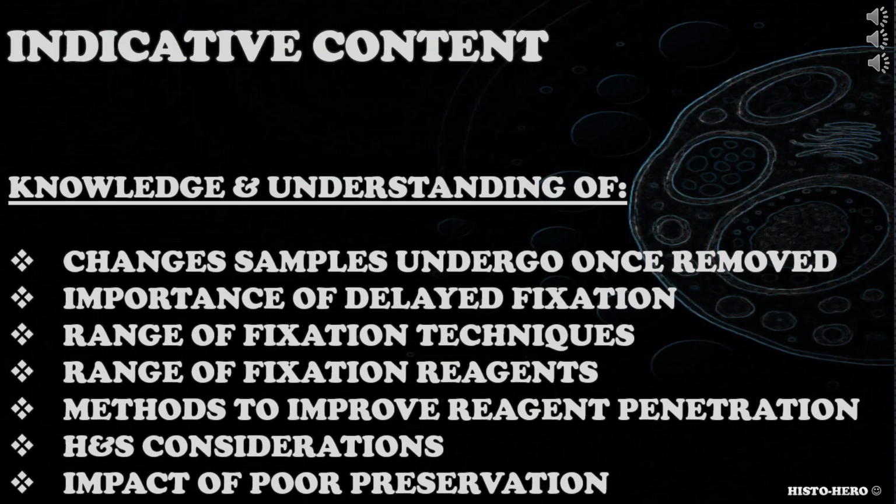Relevant to the methods to improve penetration time. What methods can improve penetration time of fixative? Consider slicing, heat, agitation, pressure, vacuum, sample size.